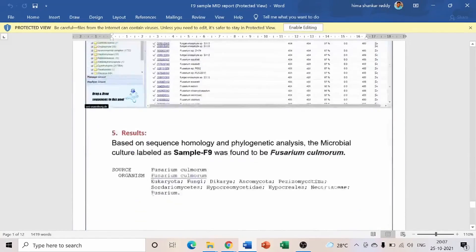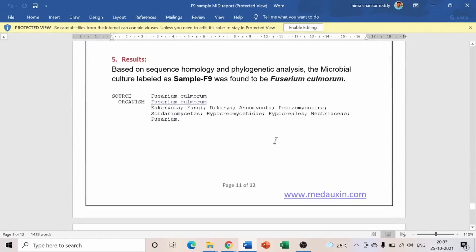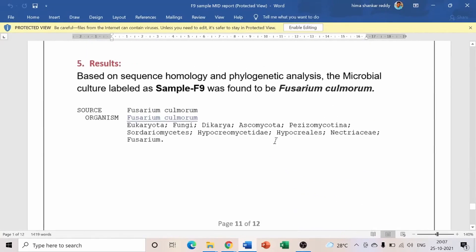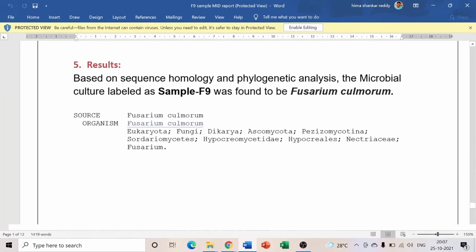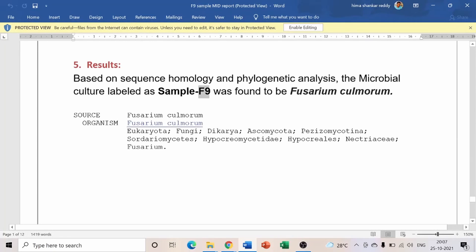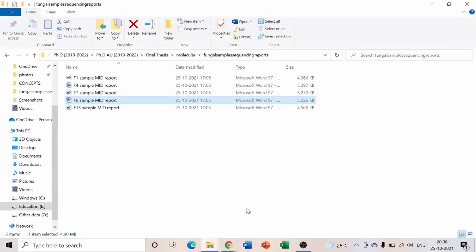The complete result appears at the end of the report. For example, sample F9 will be identified as Fusarium culmorum or similar, with all the sequence data provided by the sequencing organization.